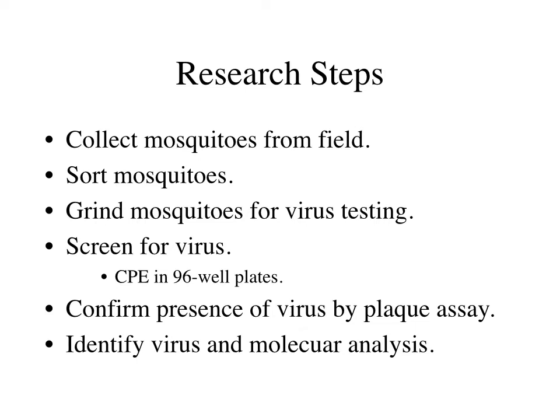That's just water with some hay that's been allowed to ferment a little bit so that it gives off volatiles that are attractive to mosquitoes. So the mosquitoes will come in wanting to lay their eggs. But above the water surface, you can see that little black cylinder. That's a fan. So when the mosquitoes come in, they get sucked up, and then they're held in that net. And we can take them back to the lab.